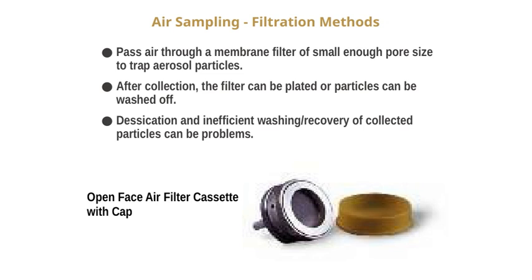However, there are some challenges to keep in mind. Desiccation or drying out of the collected particles can affect their viability or appearance. Additionally, if the washing process isn't efficient, we might not recover all the particles, which could impact our results.